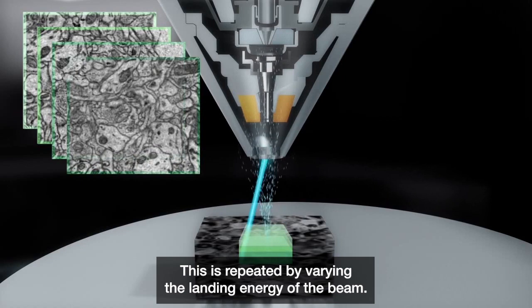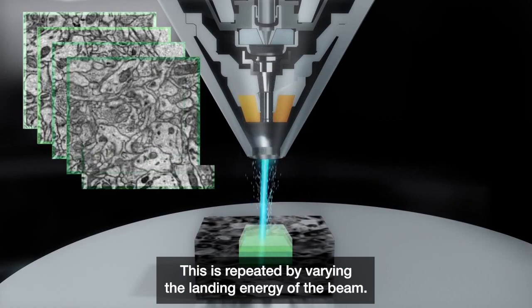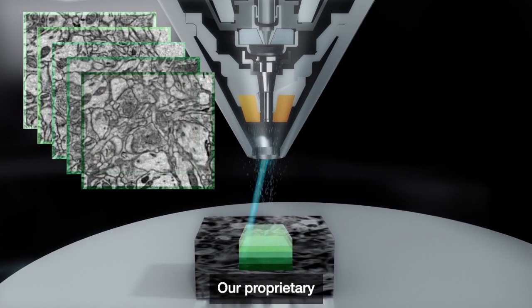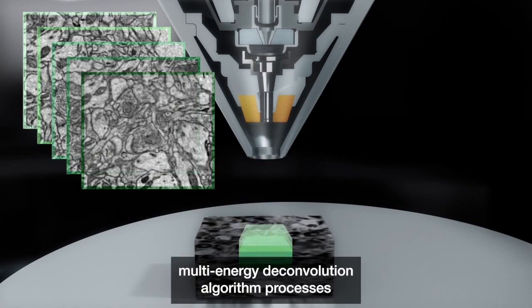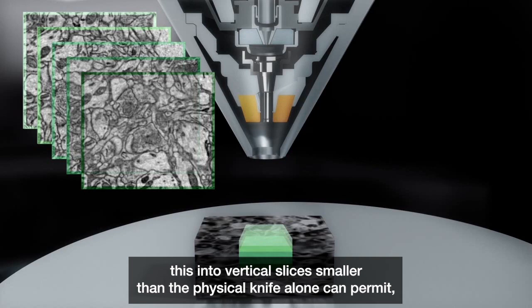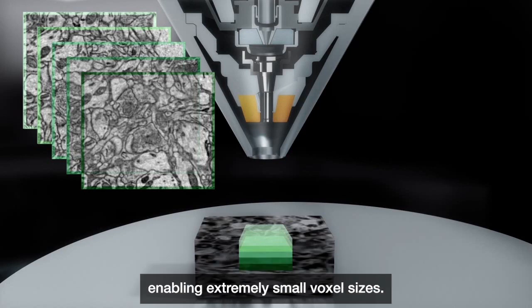This is repeated by varying the landing energy of the beam. Our proprietary multi-energy deconvolution algorithm processes this into vertical slices smaller than the physical knife alone can permit, enabling extremely small voxel sizes.